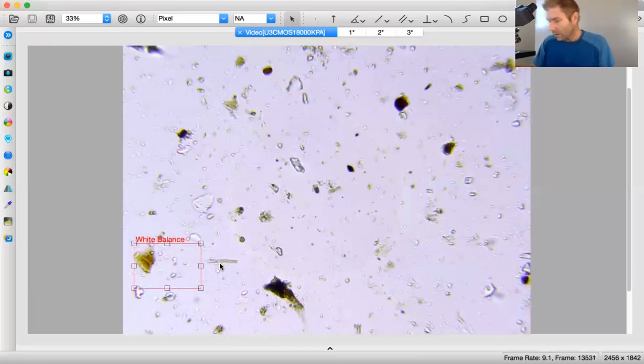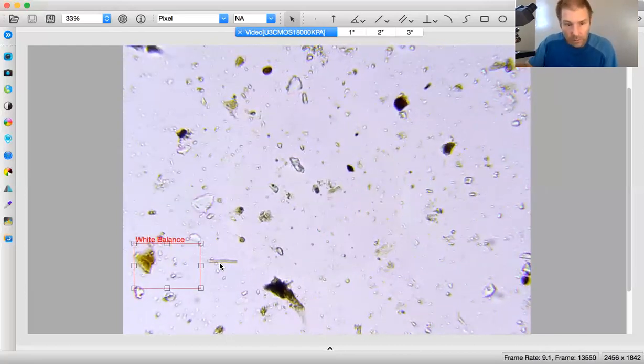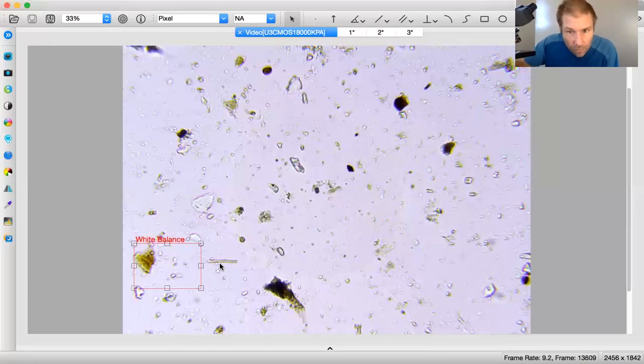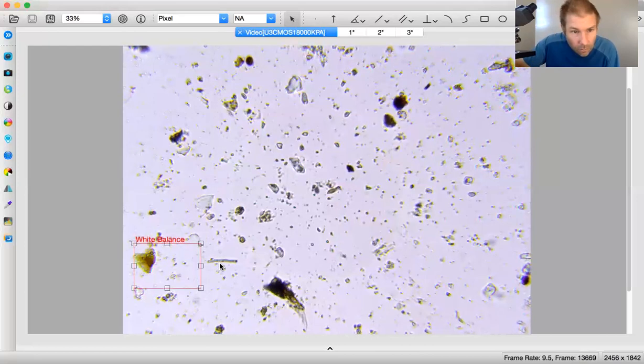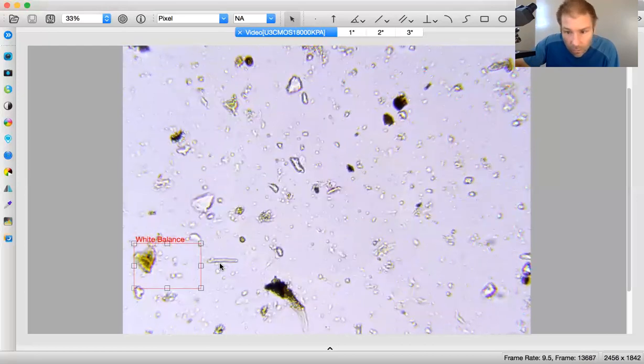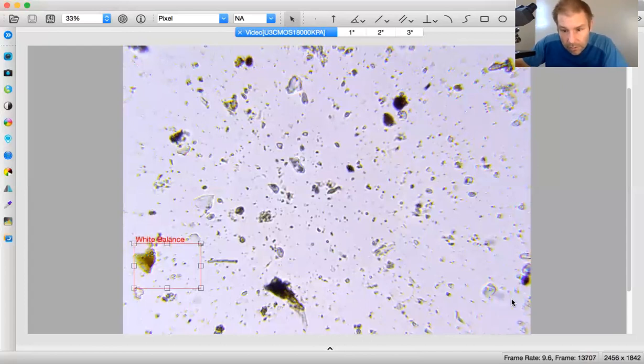Okay. So let's see. There is a piece of actino right here.